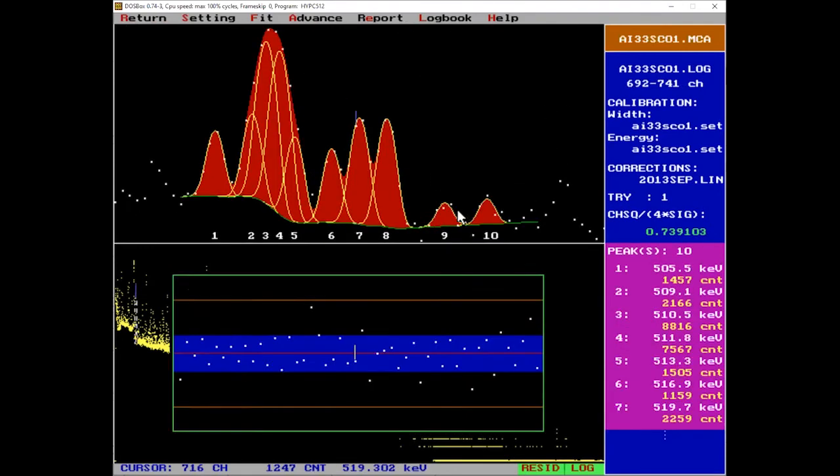Now we reach this region where the annihilation peak is there at 511 keV, and this program can fit it only with several regular peaks. So this is not the most adequate way to handle it, but in practice it can also work.